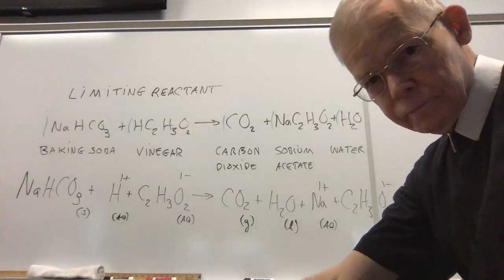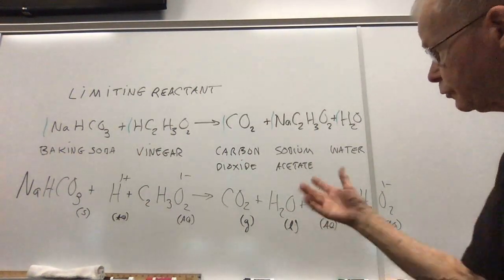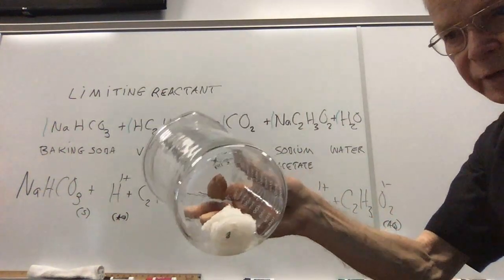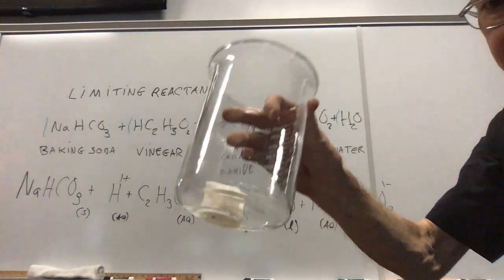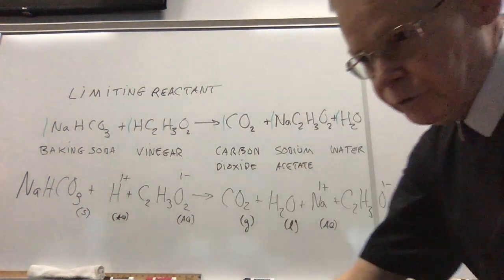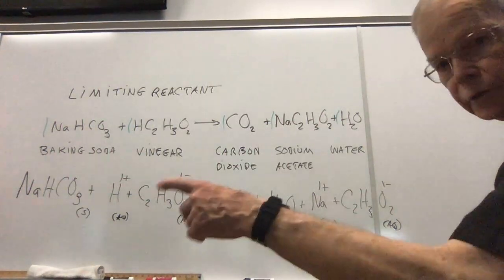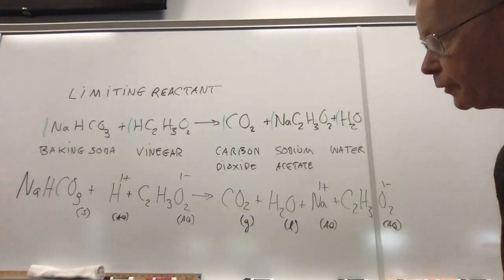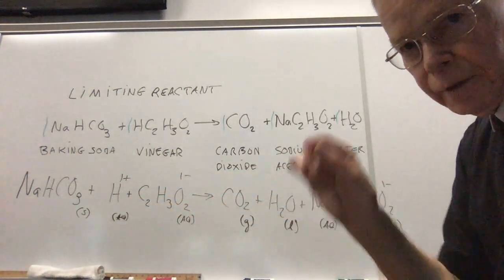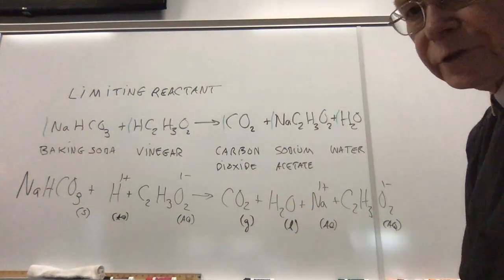And the final ideas I want to just show you very quickly are some of the ways that we can write this reaction. First of all, once again, here's one of the beakers. In the bottom I have that paper plus the lid, and there's some liquid in here and it has a little bit of a vinegar smell to it. When I show all the chemicals put together, over on the left there I have sodium hydrogen carbonate. I started with that. It's a solid, so I have in parentheses down here a little S surrounded by parentheses. And then the next ingredient is my vinegar.